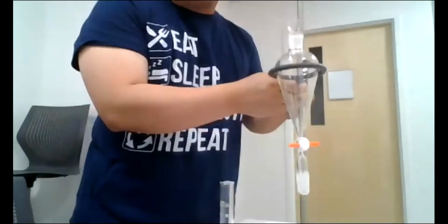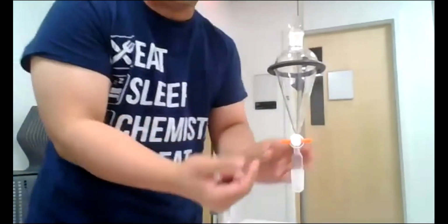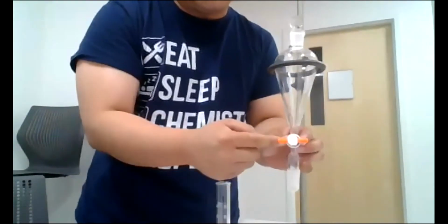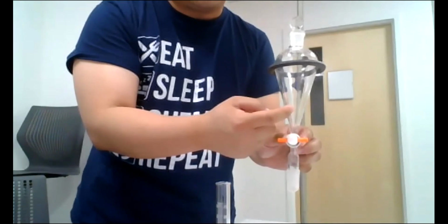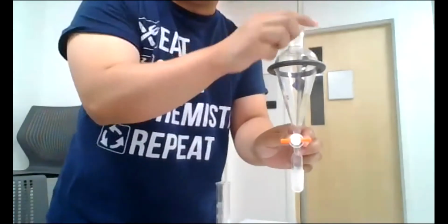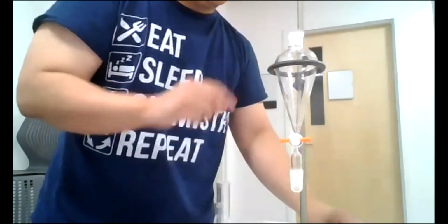So, the extraction. Let me make sure that the stopcock is closed. When the orange bar is horizontal, that means there's no hole connecting the separatory funnel vessel, and we could call this a spout. Here's the neck, way up here, and this is the stopper. No grease.